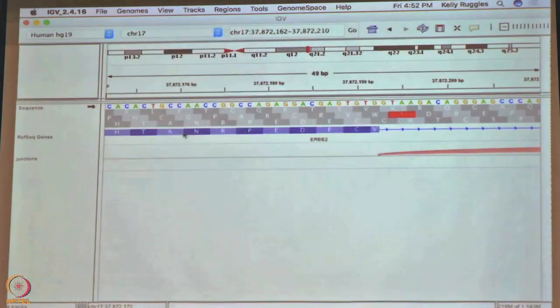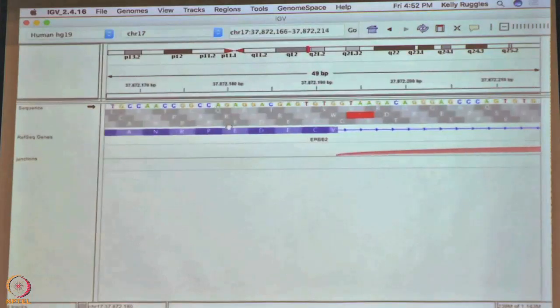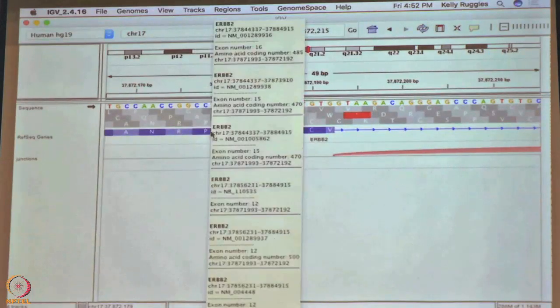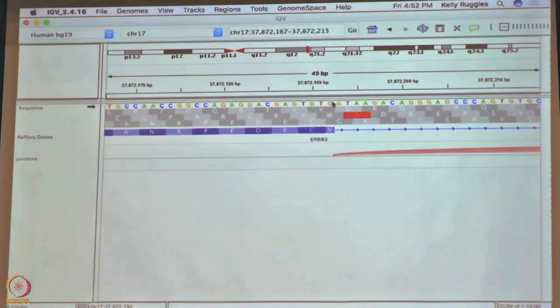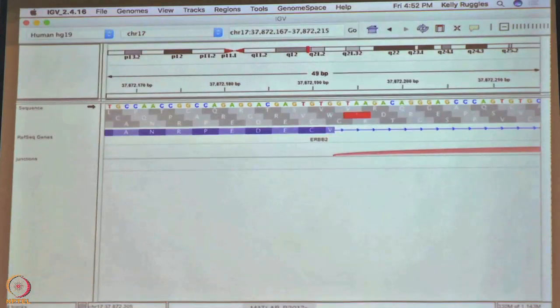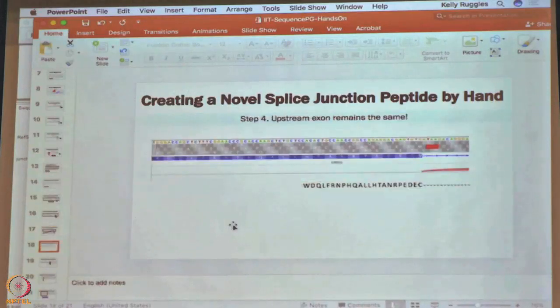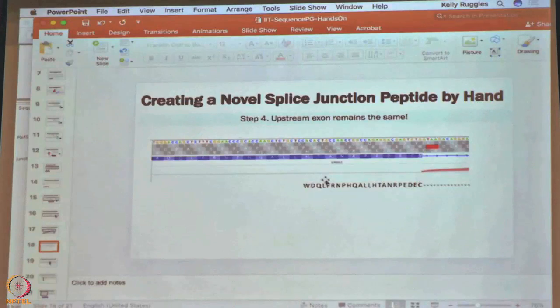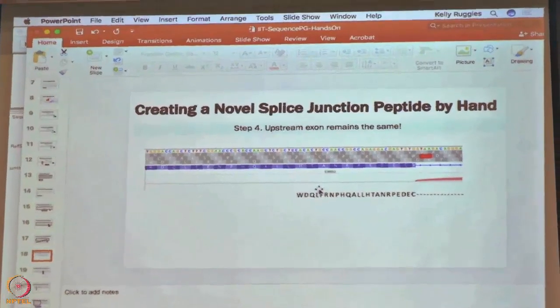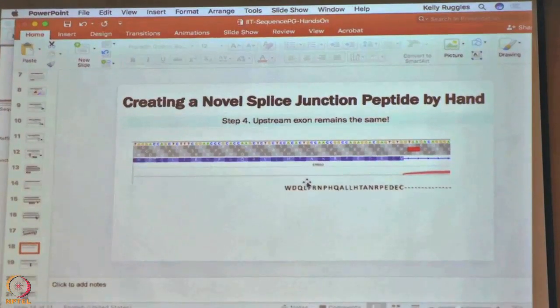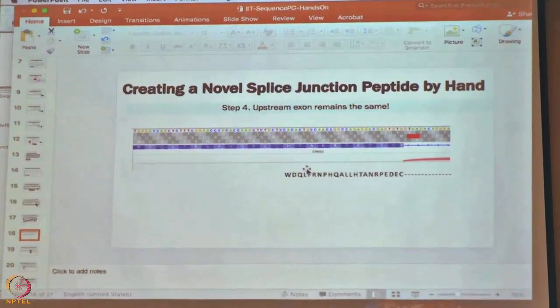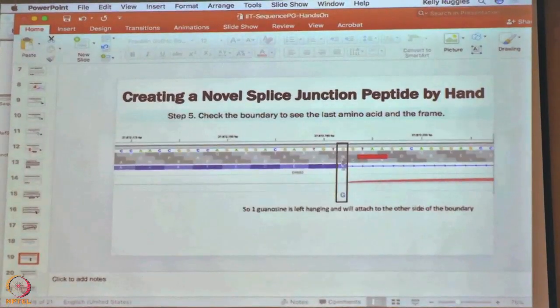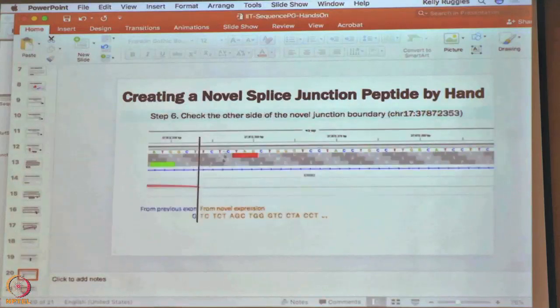What you will do here is we are going to make another tryptic peptide. Again we will start after the arginine. So it will be PEDEC and then there is this extra G hanging over. I am going to show you in my powerpoint because that might be easier. You zoom in here and we can get the sequence because we know when there is a boundary between a known exon and something new. The thing that is known we can keep as is, we take the sequence from that, then we just have to figure out what the boundary next to it, what that extra sequence is going to look like. So we take this sequence, we have this G that is hanging, and then we look at the other side of the boundary. Zoom in to the other side of this boundary here and this is where you will get the nucleotide sequence that will continue on from the original exon and then you can do an in silico translation to figure out what that full peptide would look like.